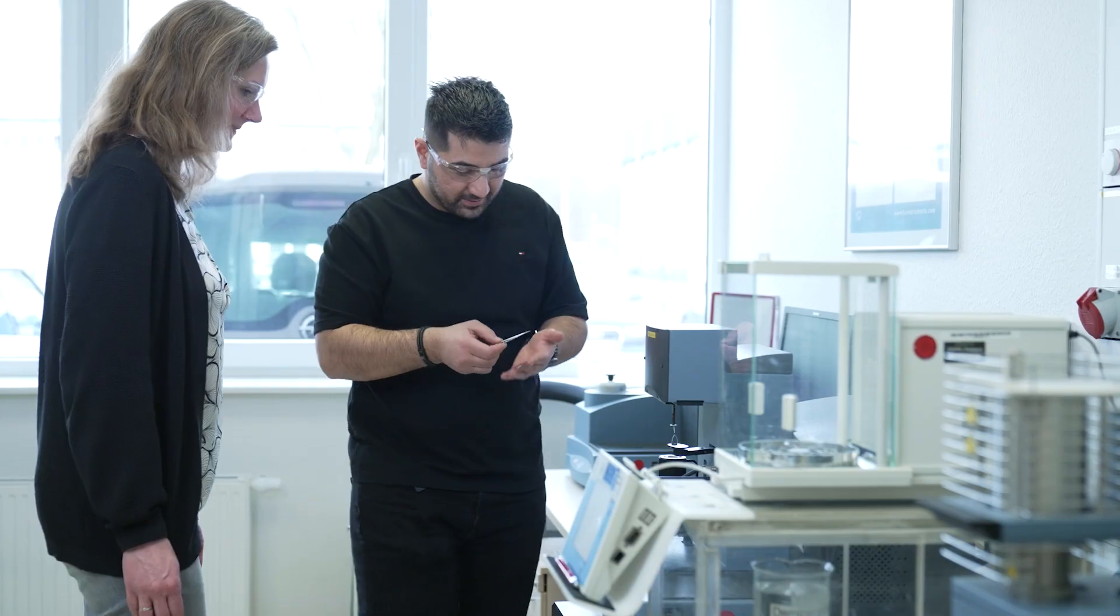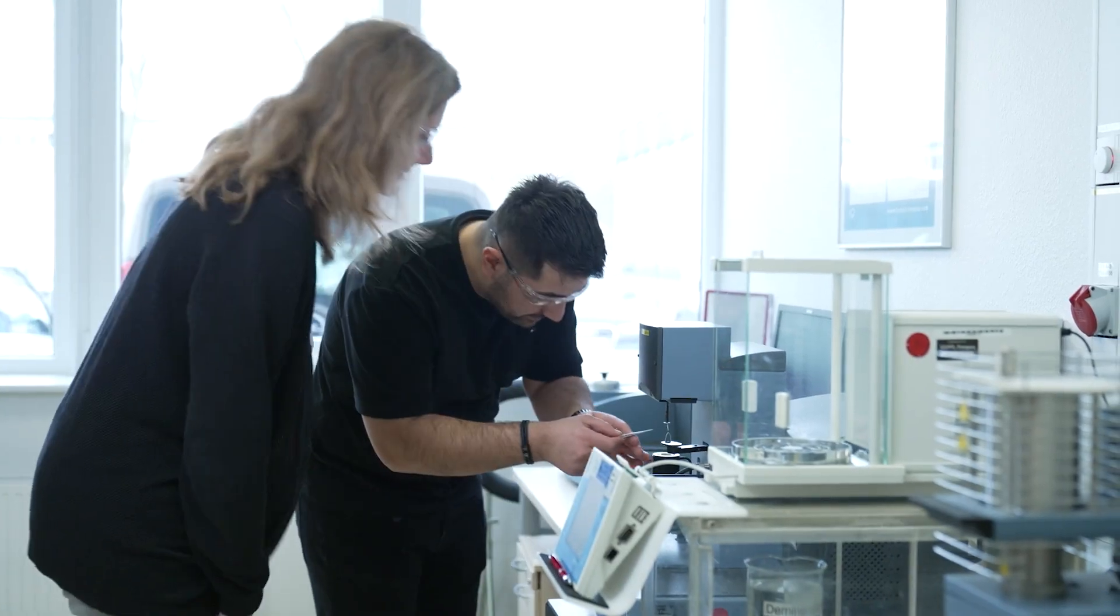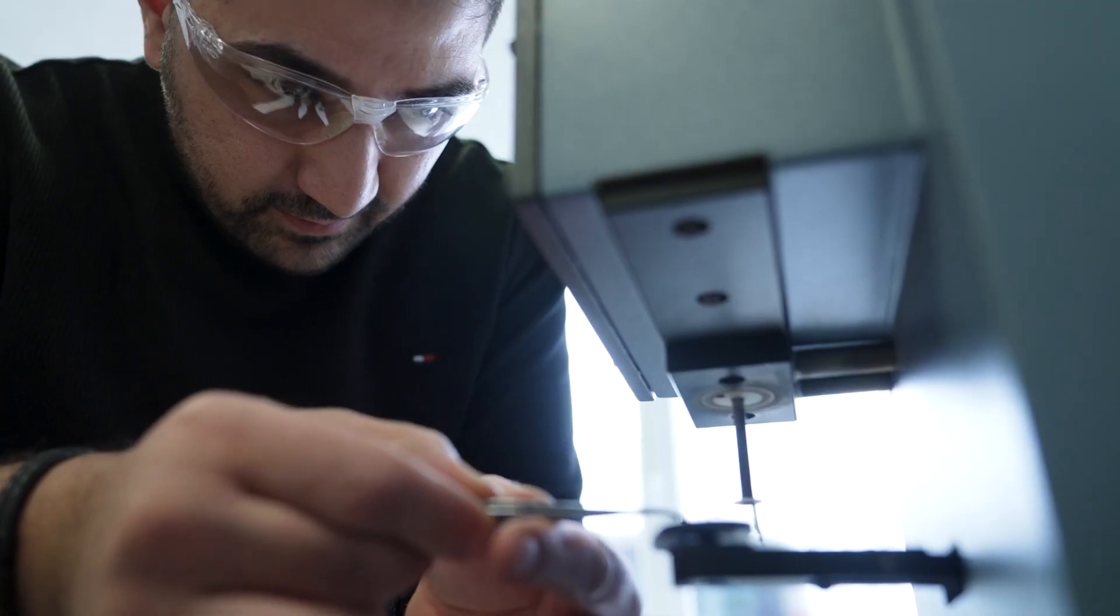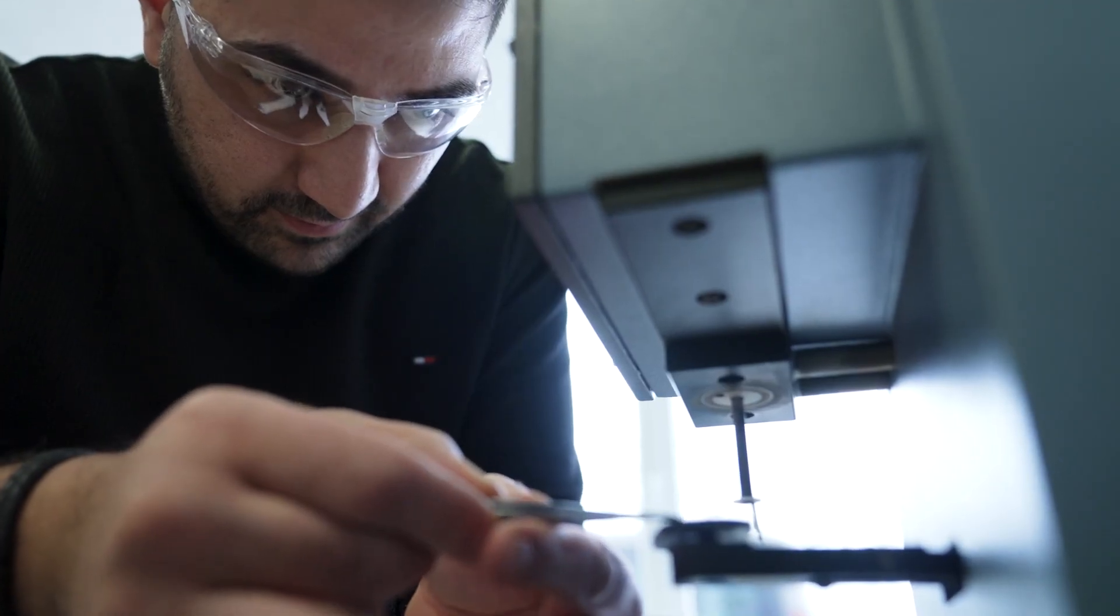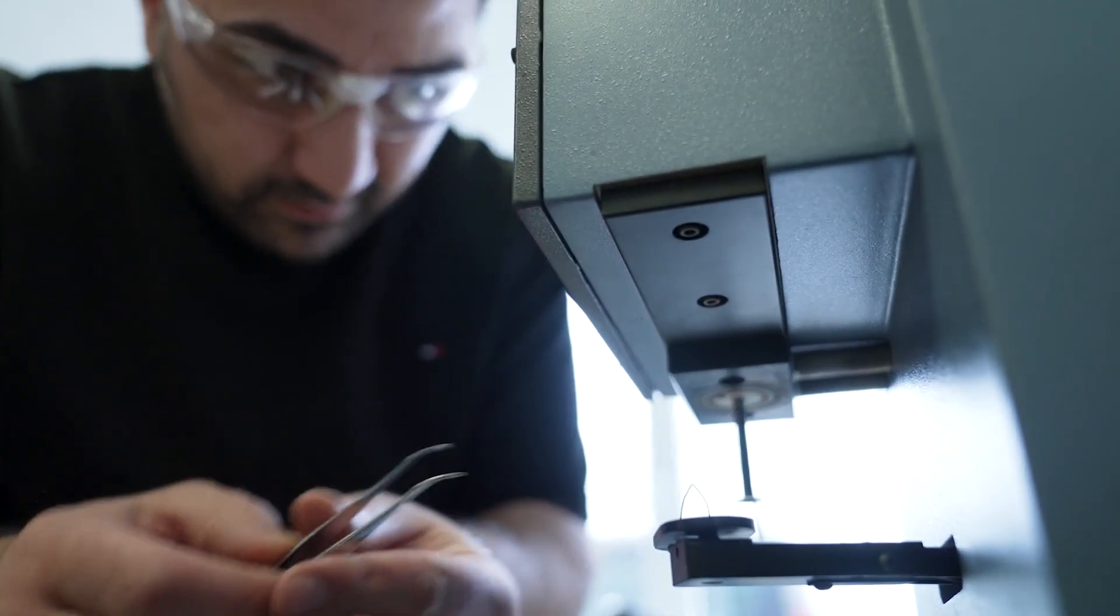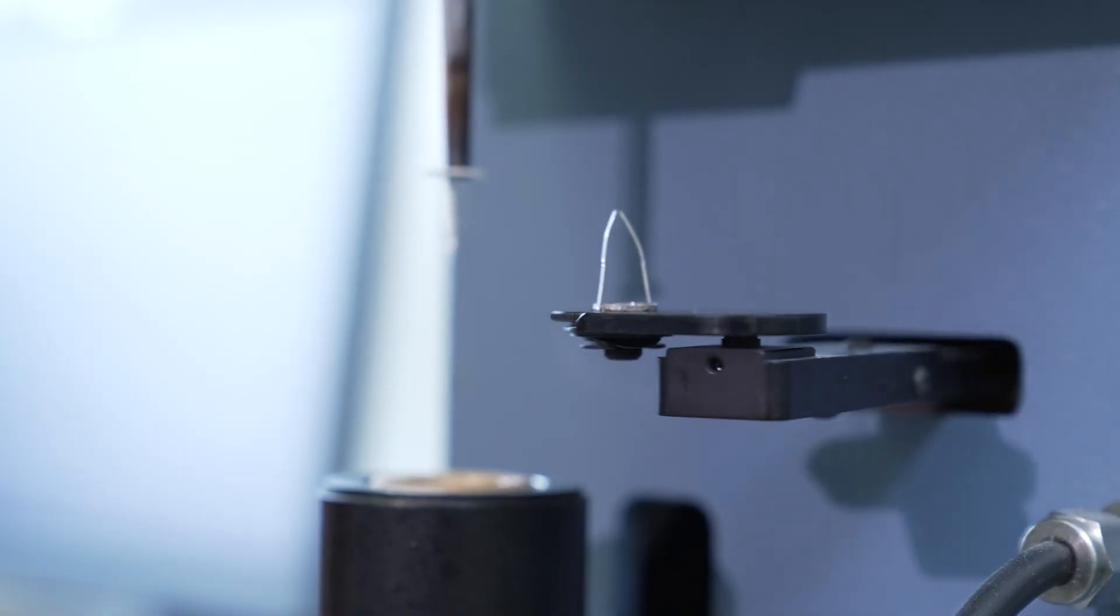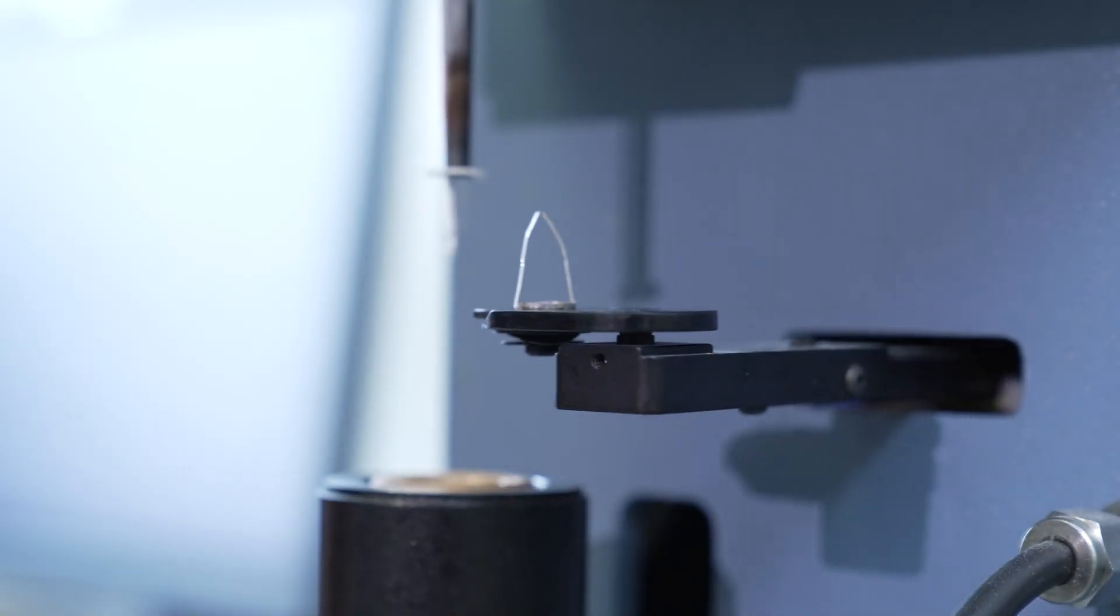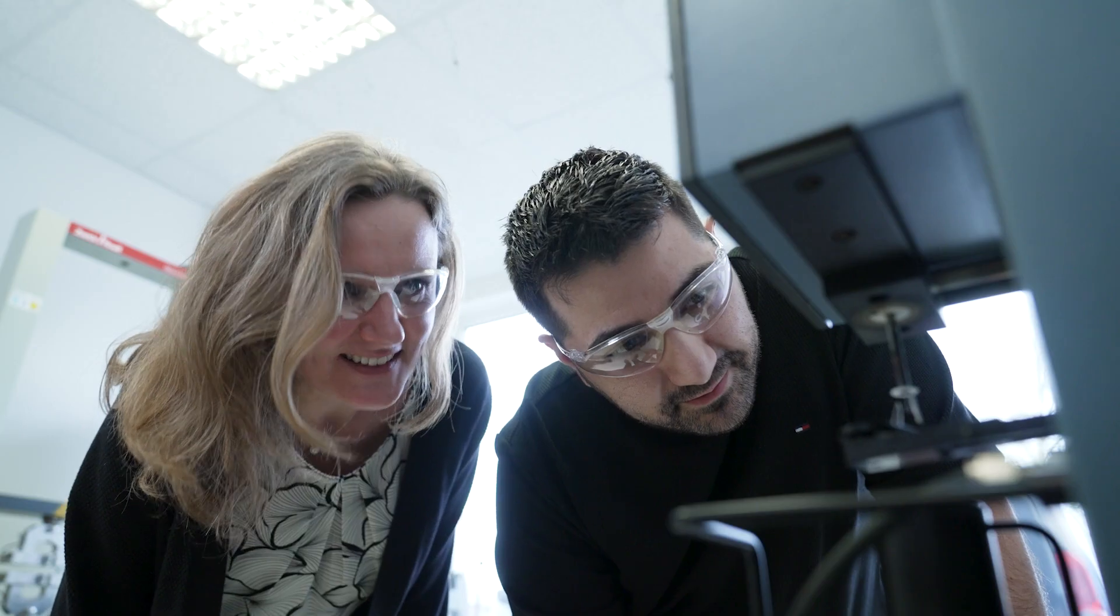What we do here is we take your sample that you want to analyze with TGA, then you put it in the sample holder. The sample is moved into the machine.